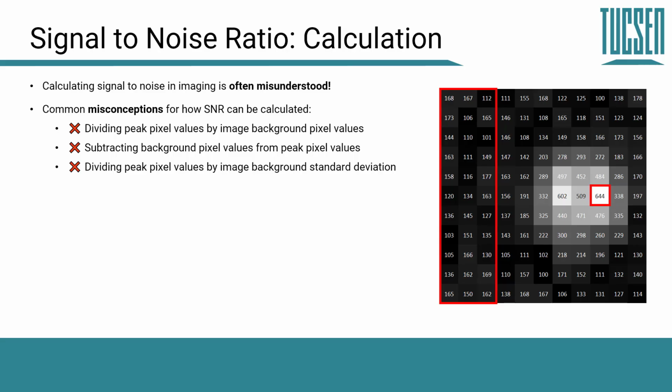What you can't do is look at an image like this and make a conclusion about the noise in the image based on the background pixel values. For one thing, there might well be collected photons in those pixels, which will of course contribute to a standard deviation measurement, and then we're effectively penalising cameras for being sensitive and capturing photons because we think those photons are noise.